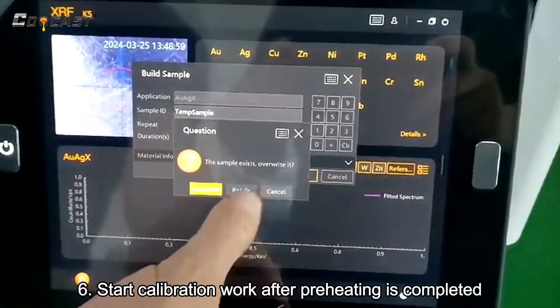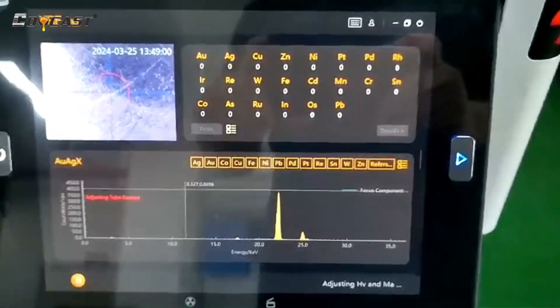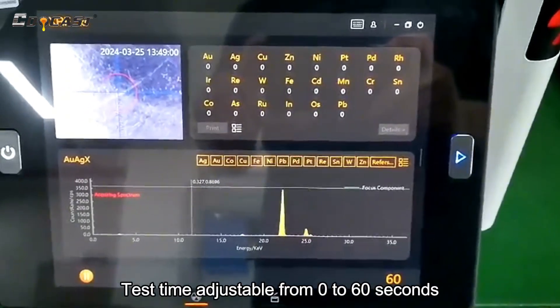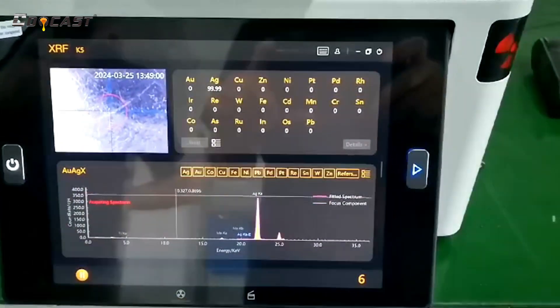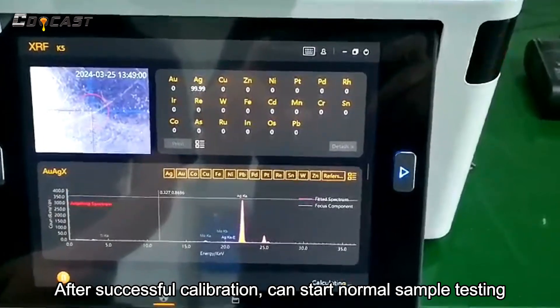Start calibration work after preheating is completed. Test time is adjustable from 0 to 60 seconds. After successful calibration, you can start normal sample testing.